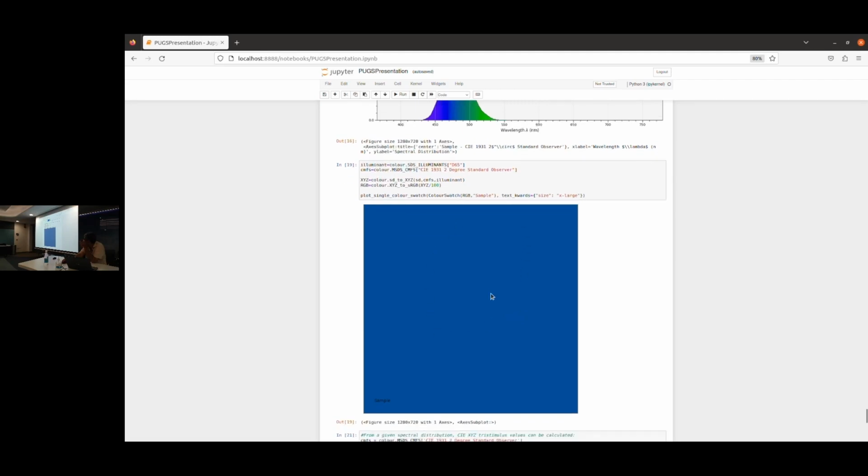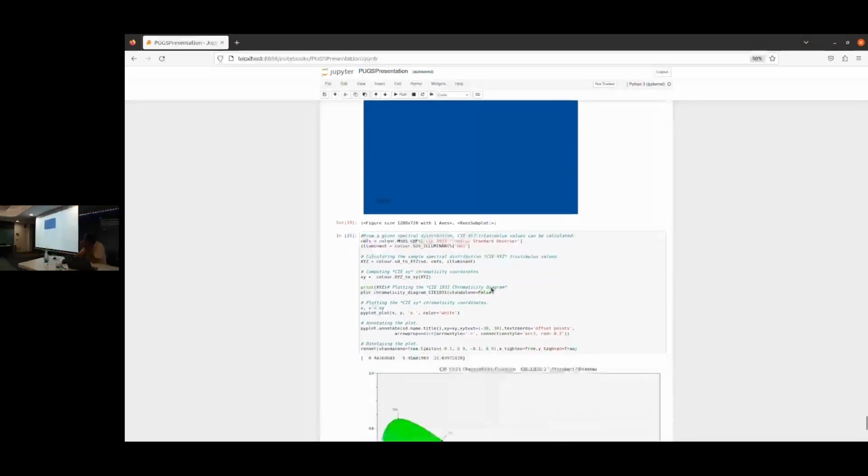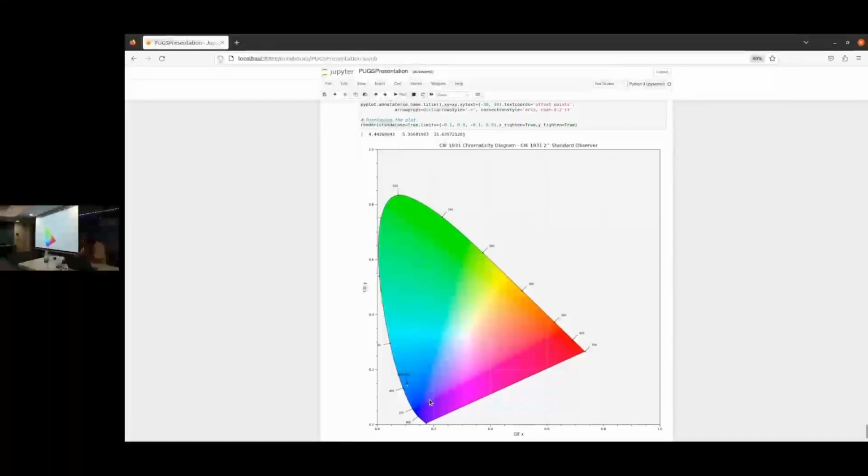So it's bluish in color, and you can plot it in your chromaticity diagram. It's somewhere here. It's slightly off from the axis, unlike the laser thing that we synthesized earlier on. It is not sitting right at this point. First of all, there are components at different wavelengths over here, and generally, you end up with some residual signal which is not real from the other side too. So it tends to pull the point towards the other side a little bit.